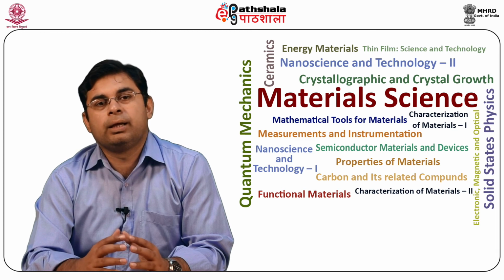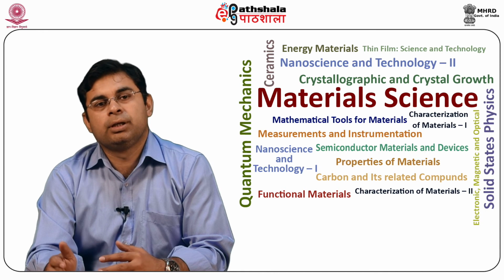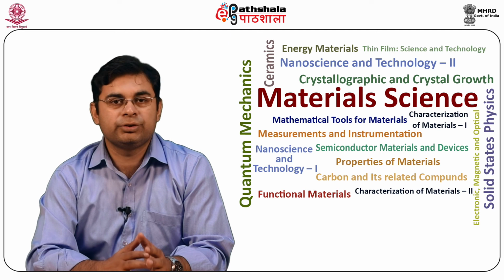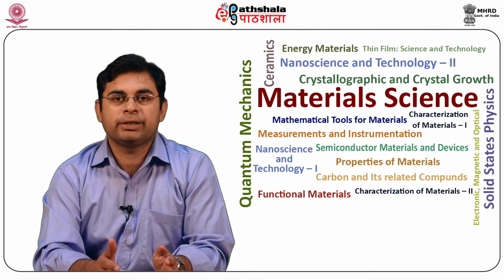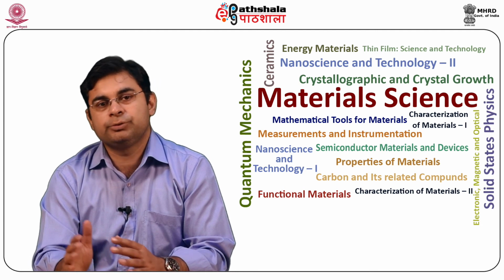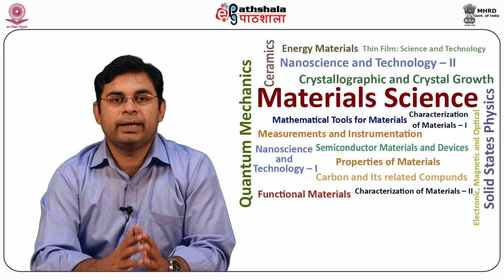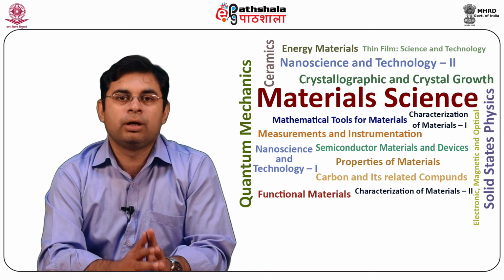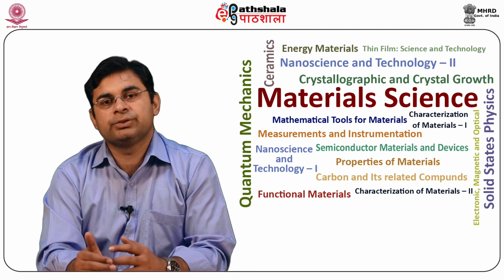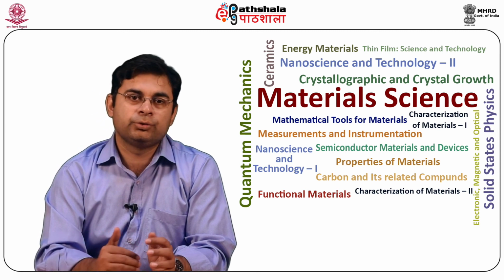Probe. An AFM probe is a micro-machined cantilever that has a sharp tip at its one end, which is brought into interaction with the sample surface. Each probe has different specifications and shape. The cantilever can be V-shaped or rectangular, providing a low mechanical resistance to vertical deflections and high resistance to lateral torsion.